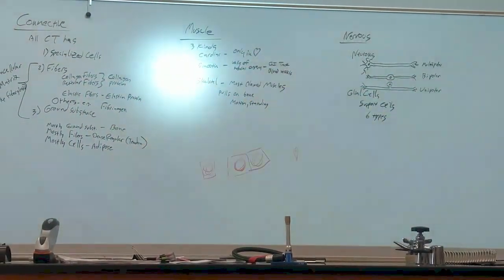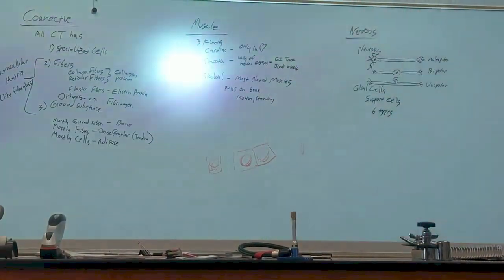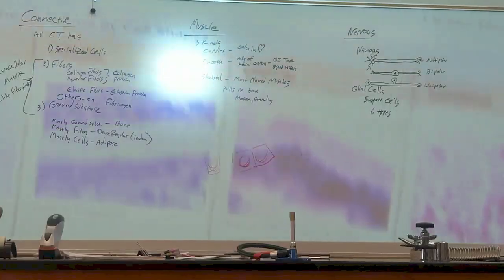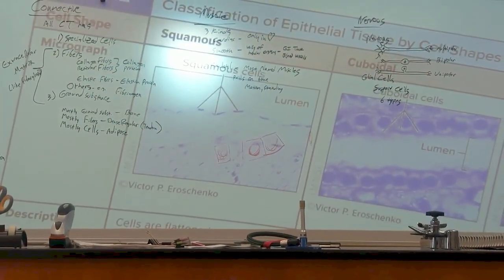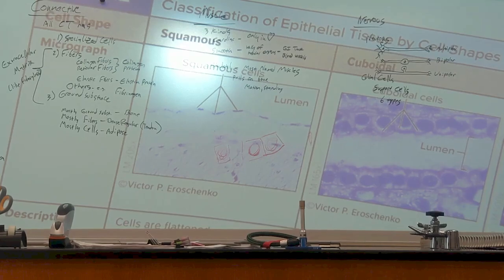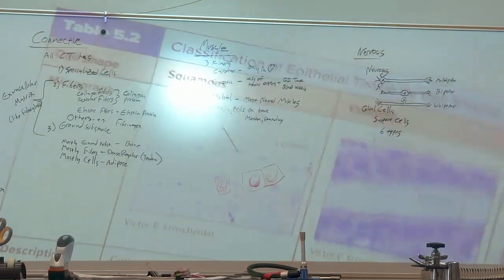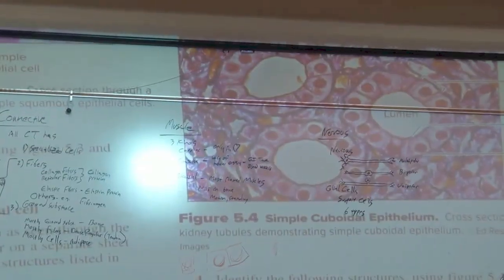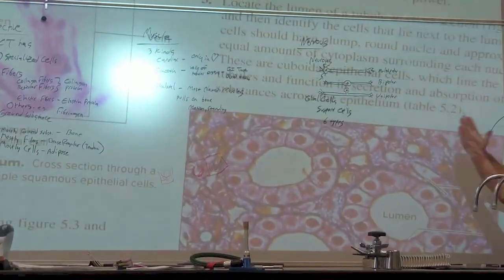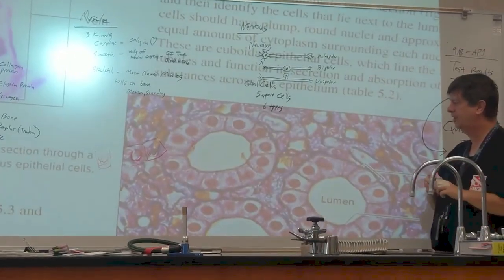In the picture on page 93, you're looking at a kidney, even though they didn't label it, I guarantee you. You're looking at a kidney tubule with a cut down the tube. Good? In the picture on 95, you're looking at the same thing. You're looking at the kidney tubule, but now you're looking at the cut going across the tube. And that really shows what I'm talking about.